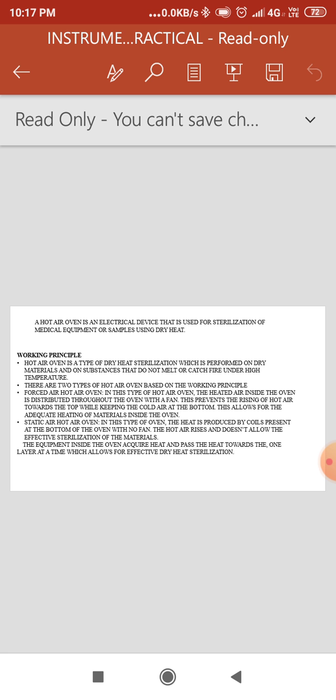In the hot air oven, as we know, wetted particles or heat-sensitive material we cannot sterilize within the hot air oven. Like plastic can melt, or media cannot be sterilized within this hot air oven. So we are going to sterilize the dry equipment or dry glassware inside this hot air oven, which tolerates high temperature. We keep it in the oven, increase the temperature, and wait. It provides a constant temperature, maintained for almost an hour to kill the most difficult resistant spores.